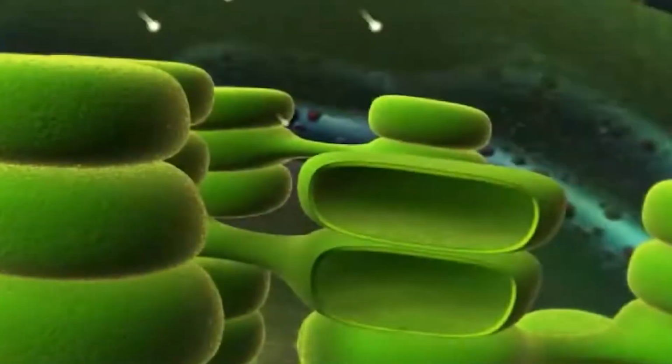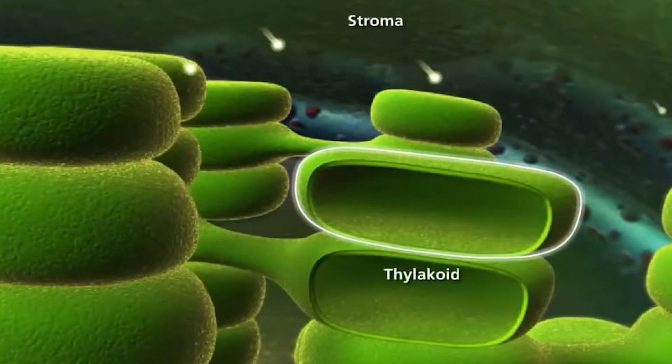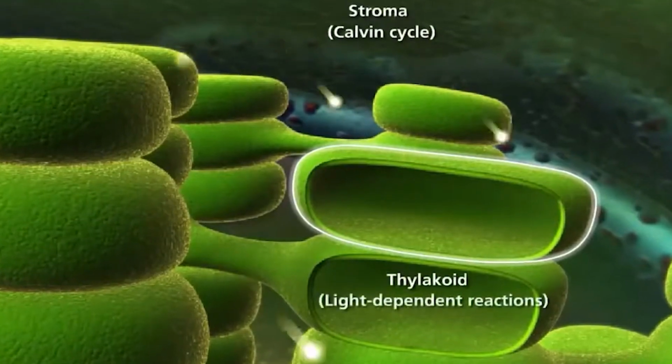Now, this specific kind of photosynthesis happens on the inner thylakoid membrane, where this incredible process occurs where electrons have to go through different photosystems and different protein channels and all this really complicated stuff, but we're not gonna have to worry about that because all we're doing is trying to make spinach leaves float, right?